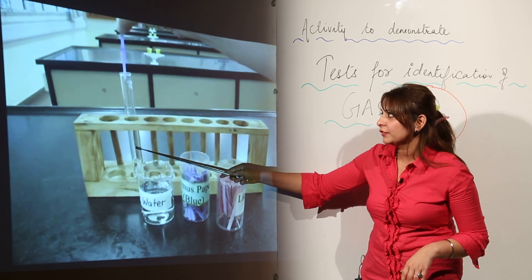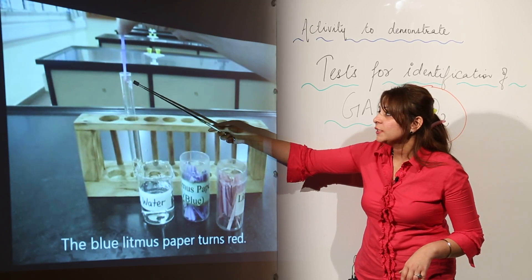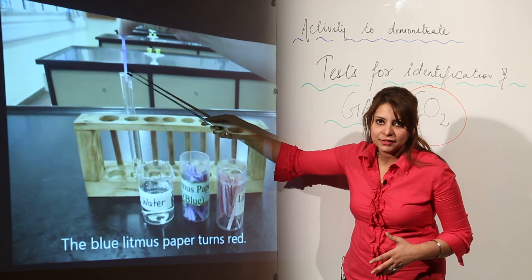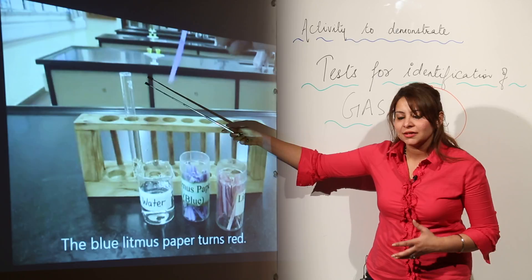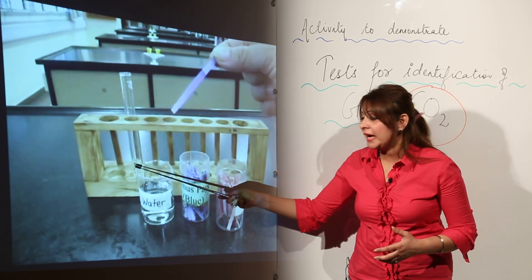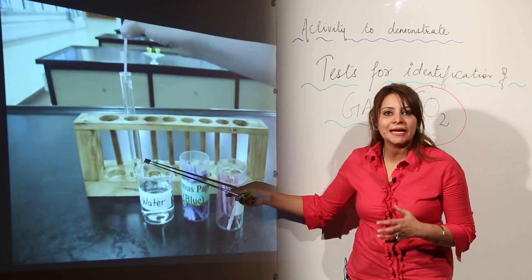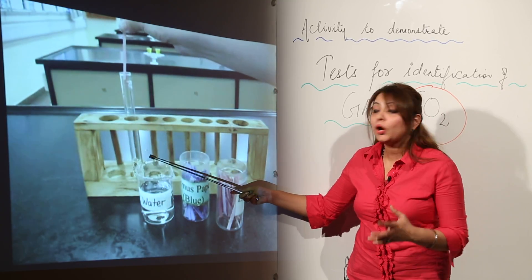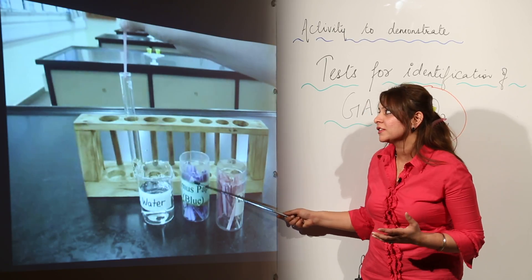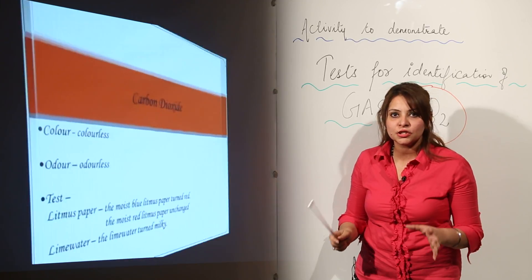Now what we are doing is adding water to this solution — we have carbonic acid — and we are using litmus paper. With the passage of time the litmus is just turning red. It is turning red because when you add water to carbon dioxide, water plus CO₂ gives rise to a weak acid, that is carbonic acid, and acid turns blue litmus red.